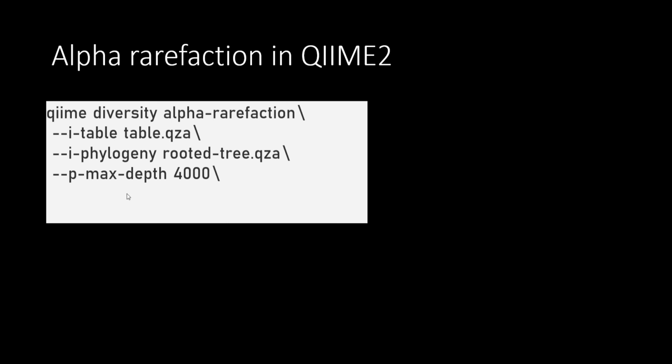And I want to kind of draw out what this is doing. So bear with me for just one second. Here we go. Go ahead and get a pen. Make it red. So let's say that you've got all your different files, right? We showed this earlier with our histogram.